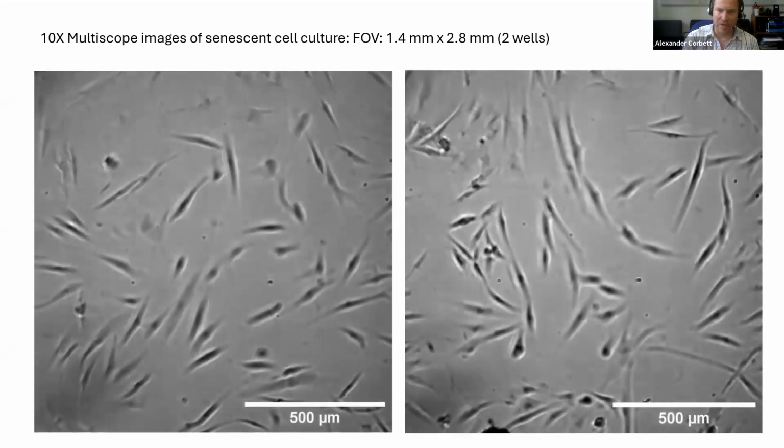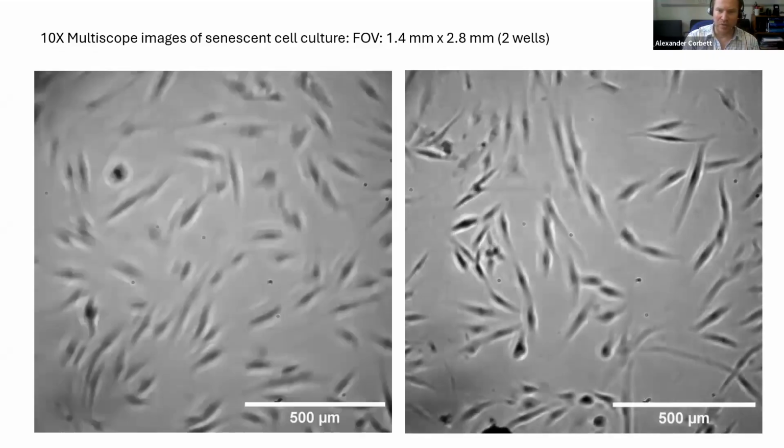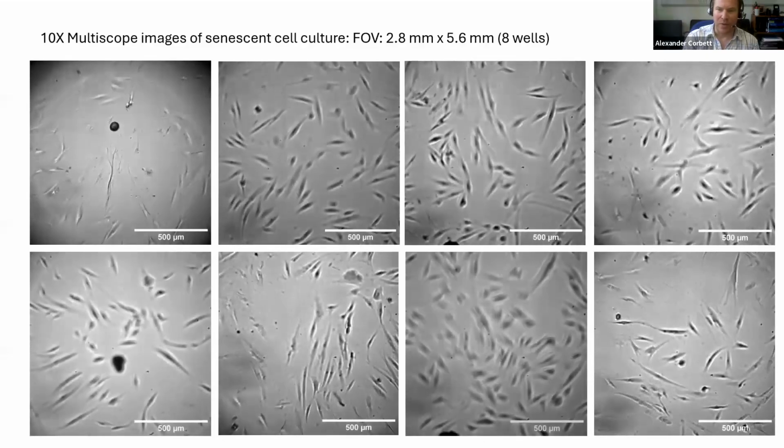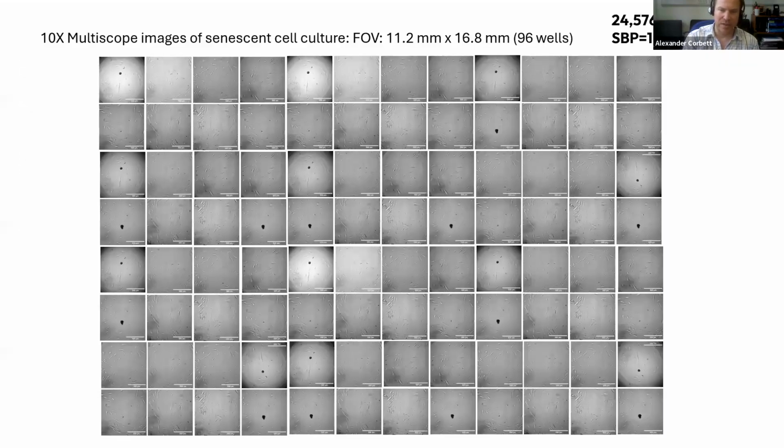And of course, we're imaging them in quick succession. So we don't have to just get one, we can get 2 or 4, or 8, and anything up to 96. So this is a 96 well imaging system, and because it's so quick to switch between wells by switching LEDs on and off, we acquire each depth, acquire the full 96 well images, move to the next depth, and then reacquire. So we can get the Z stacks across 96 wells very quickly.